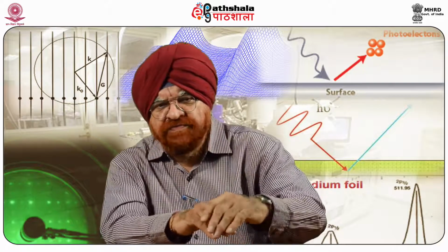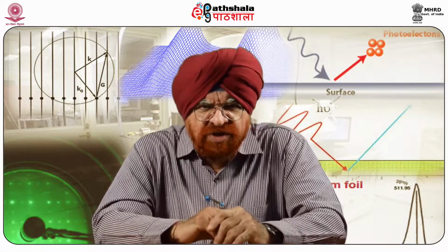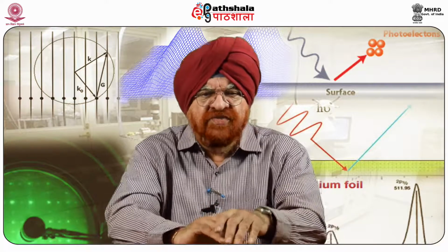Magnetic field of the tip and sample can change each other's magnetization, which can result in nonlinear interactions. Continuing with the disadvantages, this hinders the image interpretation. Relatively short lateral scanning range, on the order of hundreds of micrometers. Scanning height, that is lift height, affects the image.